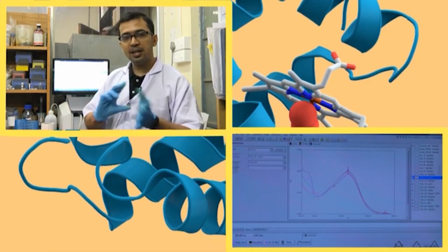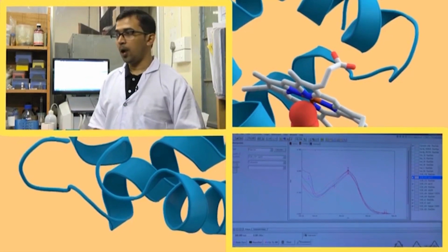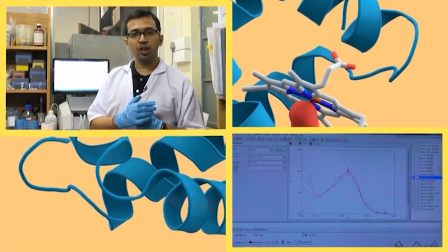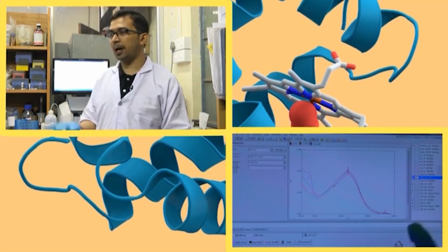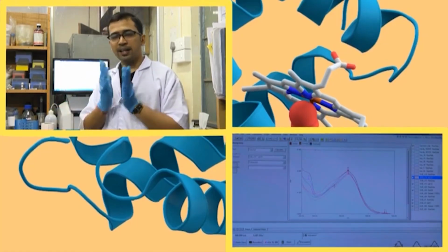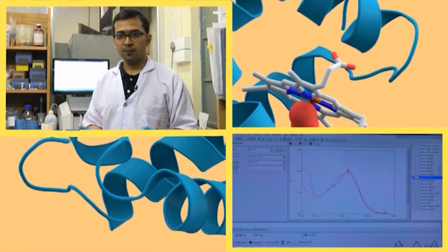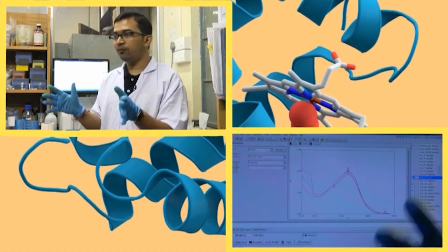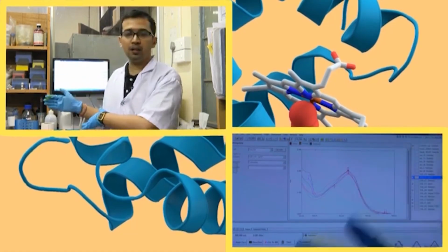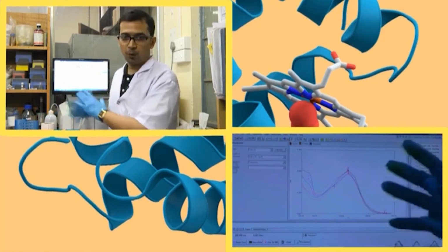If we had completely mixed it and dissolved it in water, or if we had taken a bit lower concentration of curcumin, okay, there are some errors which come from time to time, and you need to do an experiment to find out where the errors are. You can't address the error in the beginning only. So, you need to do the entire experiment to find where the errors are, and then you can repeat the next experiment only with the same condition.